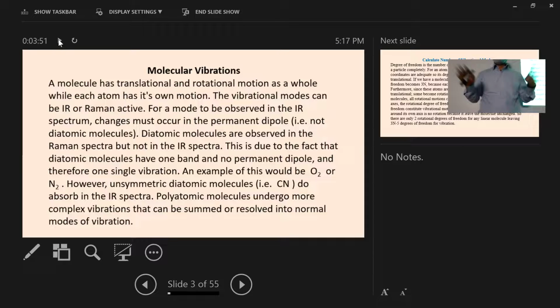That means the different patterns or orientations or movements of the atoms in the molecule are considered as vibrations or molecular vibrations. So how the atoms can move compared to one atom to another. If we consider this as a spring, you can easily understand how it can vibrate.